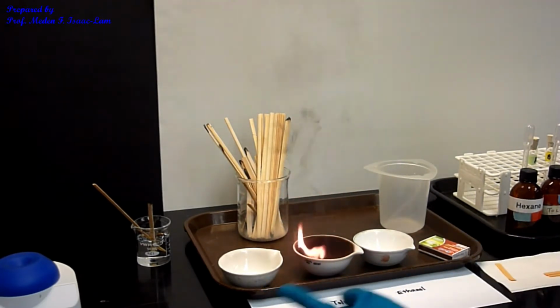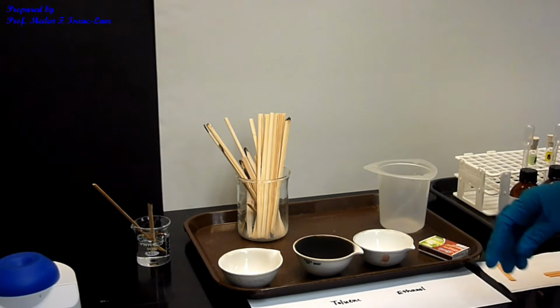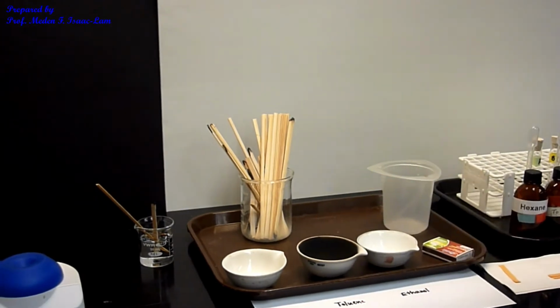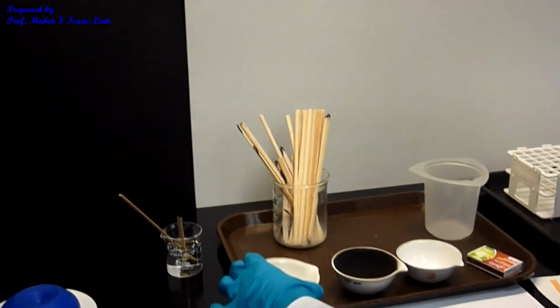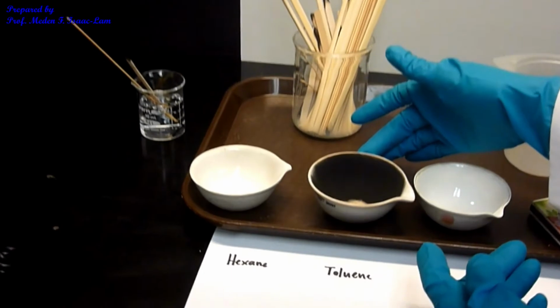So the hexane was clean. This one is dirty. It's a lot of carbon being burnt. So you can look. It's still hot. But anyway, this one was clean. And this one you can see dark. Okay?